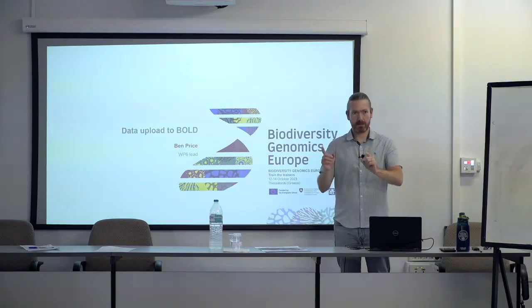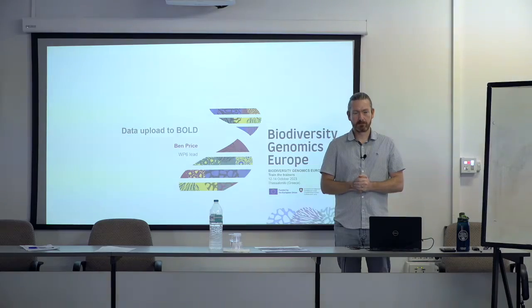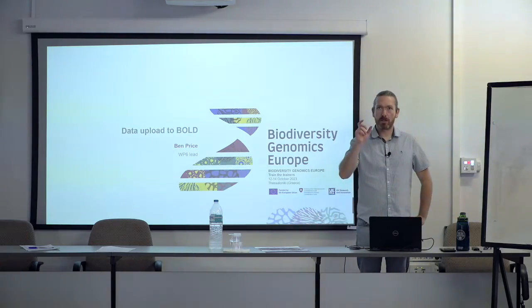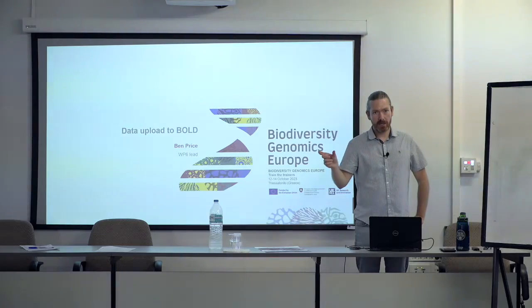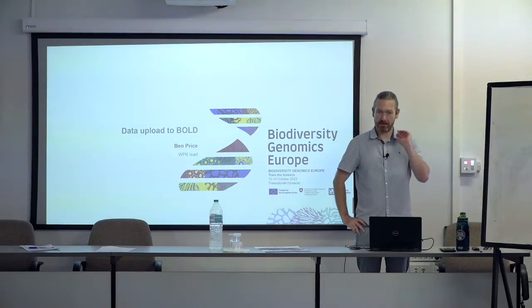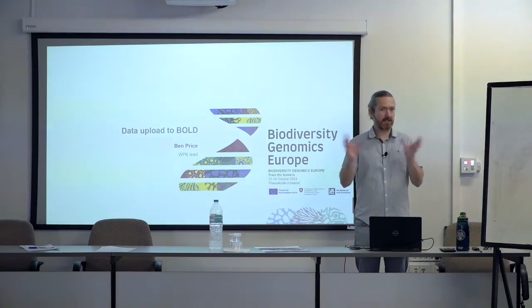Sorry, Glenn, I think, then Sarah. It seems like that hotline is a bit... Do you use it for metabarcoding? The BOLD digger? Yeah. I have, but when the batch sizes were bigger. Now it's just... So there are pipelines that will put the public data from BOLD and GenBank together, but not the private data. That is private. You can only access that within BOLD, through BOLD. And you don't get to see it. You just get to hit against it. That's all. Yeah, which is not good.